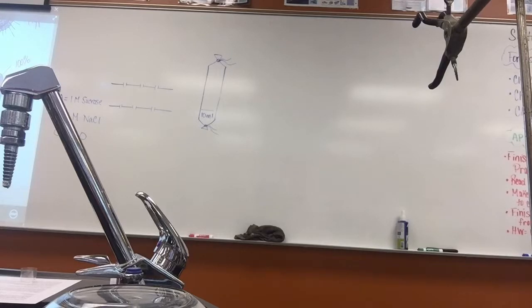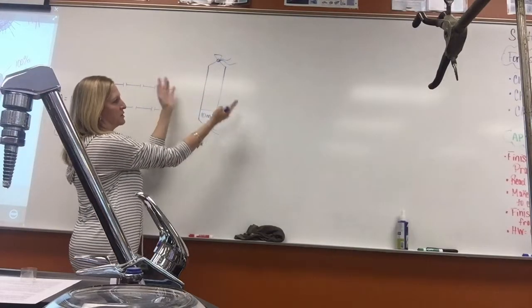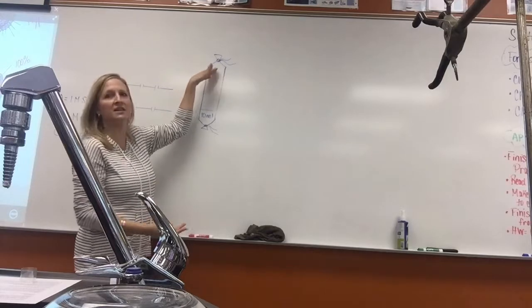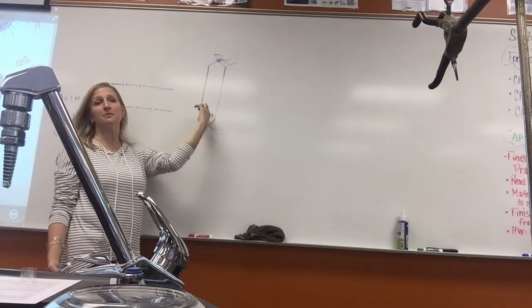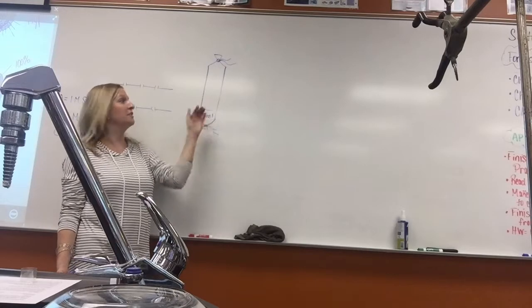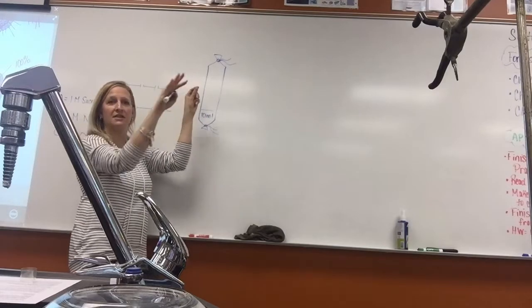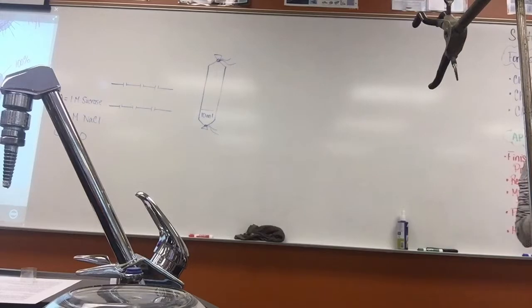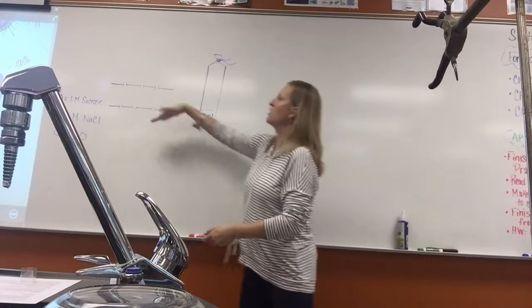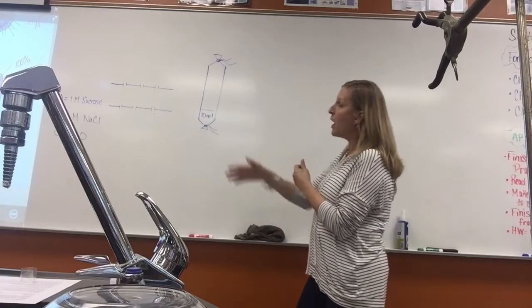So you have space? Yeah, so you have more space for the molecules to diffuse either into or out of the cell. So what that's doing is increasing the surface area, right? So your volume is your 10 milliliters, but once you go like this and go like this, it'll kind of go out throughout the cell, and so you have that 10 milliliters with lots of surface area for diffusion to occur. And so diffusion will occur, remember, if the molecules are smaller than the pores.